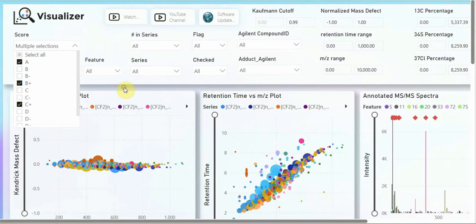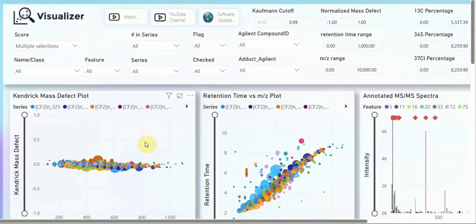And so right away in your data set, if you have high confident PFAS, depending on how complex your matrix is, you should see some interesting patterns already. Note this is AFFF contaminated soil, so don't expect to see this many PFAS if you're running blood, urine, etc. You won't. But you will still be able to discover other unknowns.